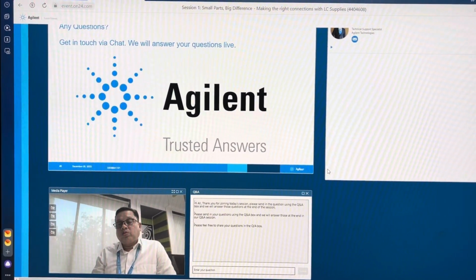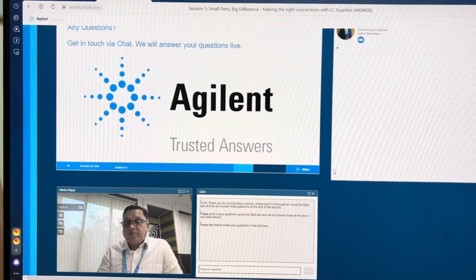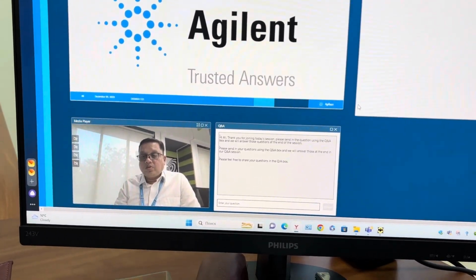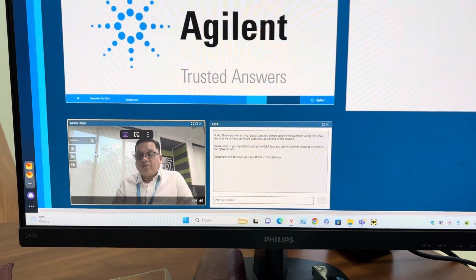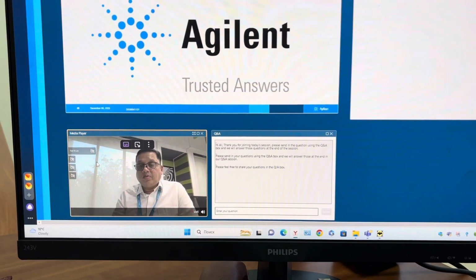Okay, thank you. One more question is related to the column. What they are asking is, what are the major criteria for consideration when you are choosing an equivalent column?